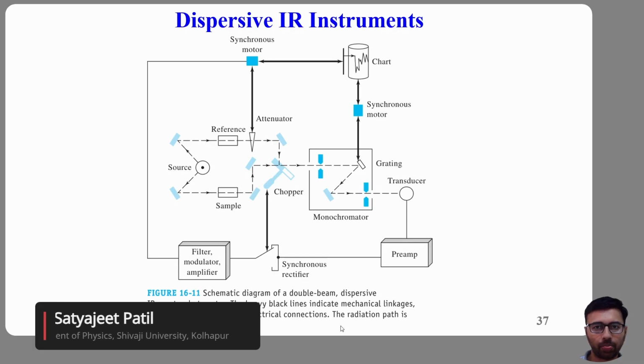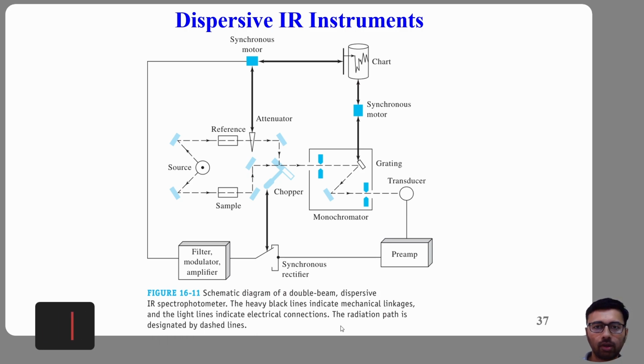Welcome back, everyone. Today, we are going to take a brief but important step backward in time. Over the last several lectures, we explored the incredible power of Fourier transform infrared spectroscopy, or FTIR. We learned how modern spectrometers use interference, interferograms and Fourier mathematics to rapidly generate highly accurate infrared spectra, but before computers became powerful enough to perform rapid Fourier transforms, spectroscopists faced a major challenge.